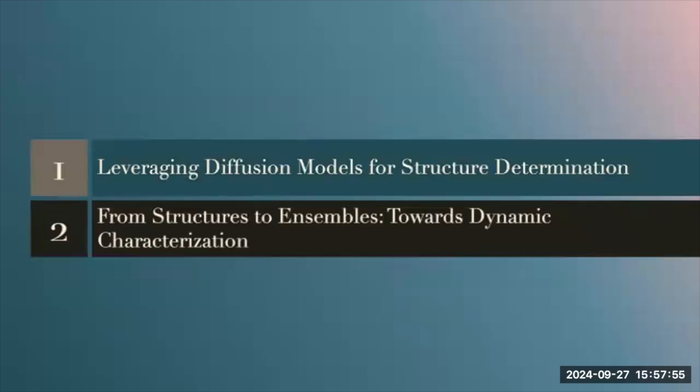And here I'm going to talk about a method that we've called ADP3D, and that stands for atomic denoising prior for 3D reconstruction. There are a few inverse problems we've been looking at. I would like to maybe give a disclaimer right away. I will only give results with simulated data, and we are currently working on having results on experimental data. So this is all validation of the methods, and there are three problems we've been looking at.